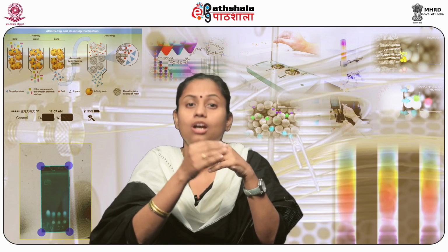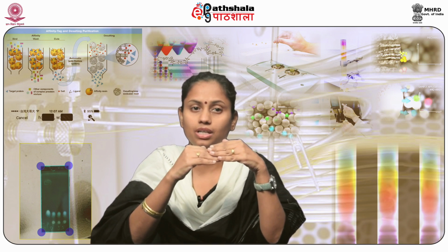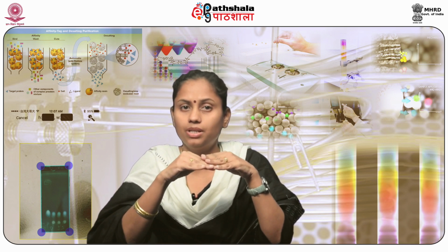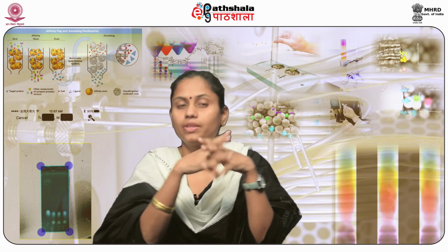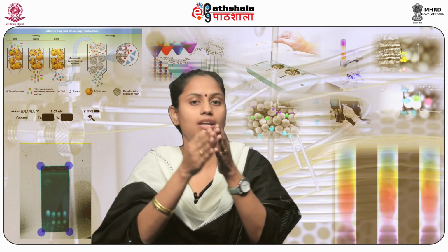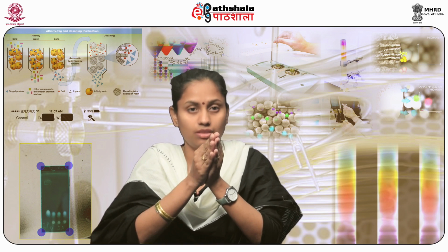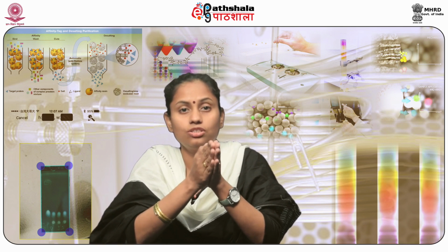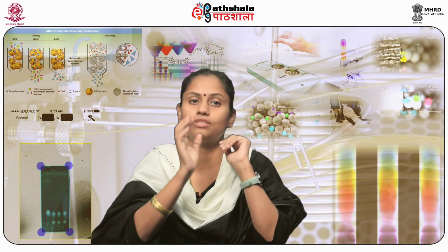The molecules with the lowest net charge at the selected pH will be eluted first from the column as ionic strength increases. In a similar fashion, the molecules with the highest charge at a certain pH will be more strongly retained. These will be eluted last. The higher the net charge of the molecule, the higher the ionic strength required, as discussed earlier. Therefore, by controlling changes in ionic strength using different forms of gradient, molecules such as proteins are eluted differentially in a purified and concentrated form.